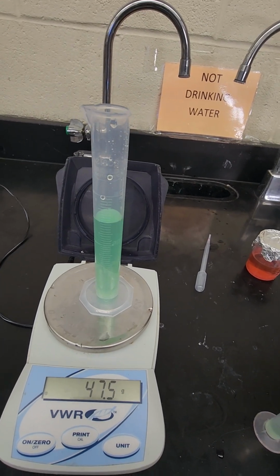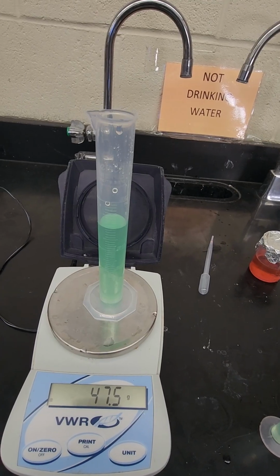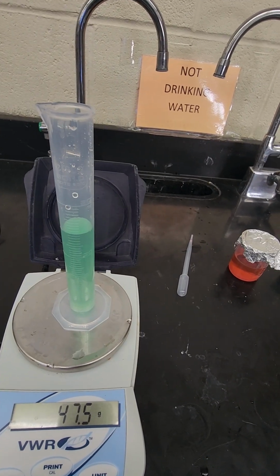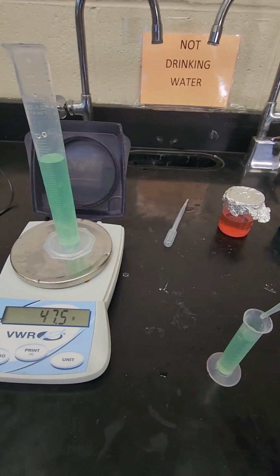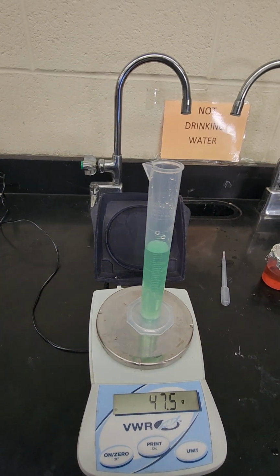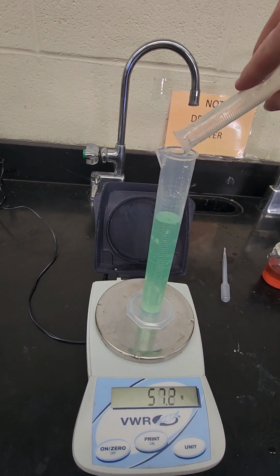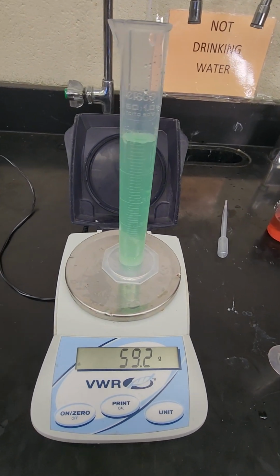And then for the very last one at 50 milliliters, I'm working on it. I need a little bit more in there. Okay, 50 milliliters has a mass of 59.2 grams.